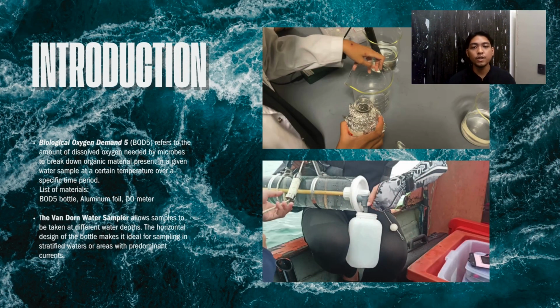Firstly, we're going to go into the introduction. So biological oxygen demand 5, or as we call it BOD5. BOD5 refers to the amount of dissolved oxygen needed by microbes to break down organic material present in a given water sample at a certain temperature over a specific time period. In this experiment, as we call it BOD5, the time period is 5 days and the temperature is a constant room temperature, which is 27 degrees Celsius.